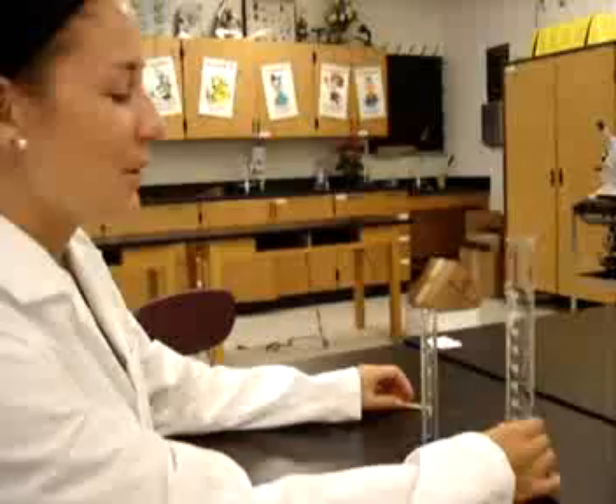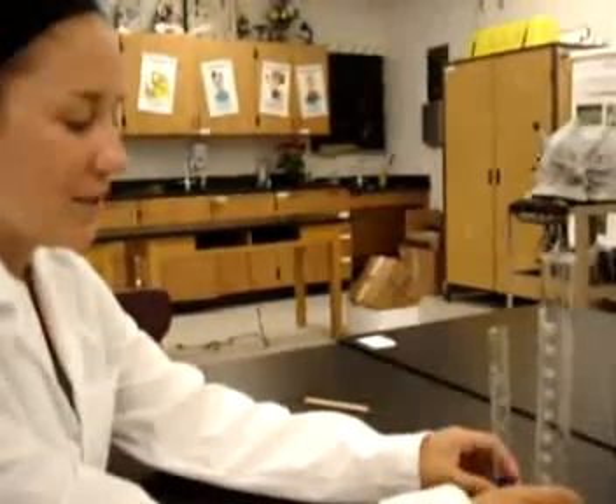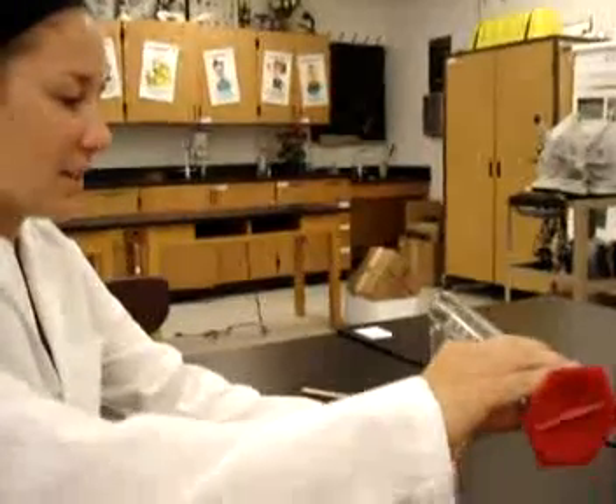This is how to correctly use a graduated cylinder in order to measure liquid and volume in milliliters. First, we're going to pour the liquid from the larger graduated cylinder into the smaller one. Be careful and really try hard not to spill.